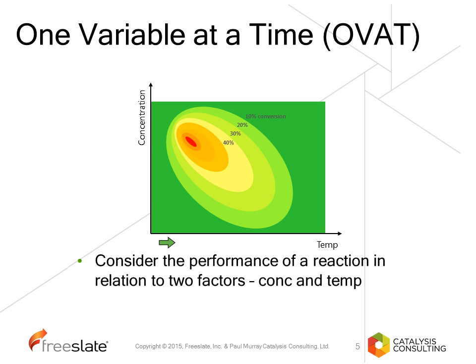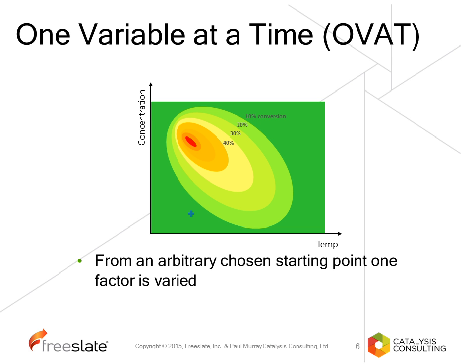When we come to this reaction, we carry out an experiment, and from that experiment, we get a result. And the result for this reaction is very low. So we have 10% conversion or less in this reaction. We still have starting materials. So logically, people as a chemist would move and increase the temperature.